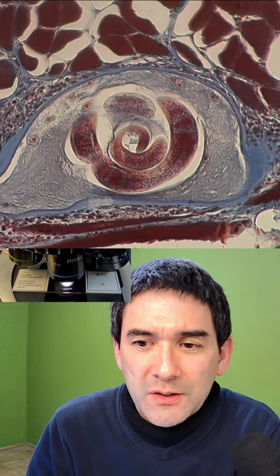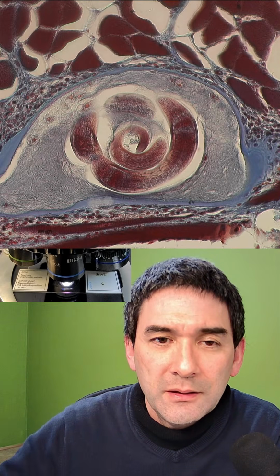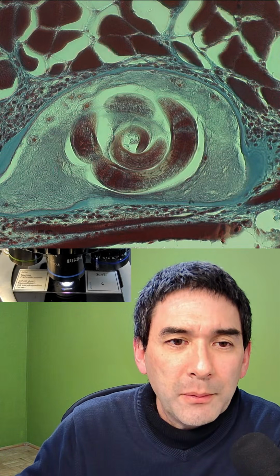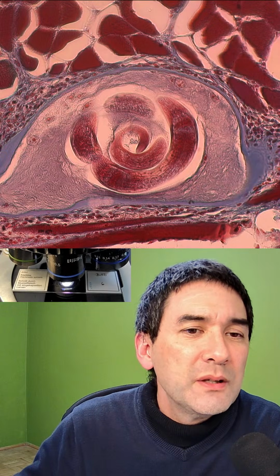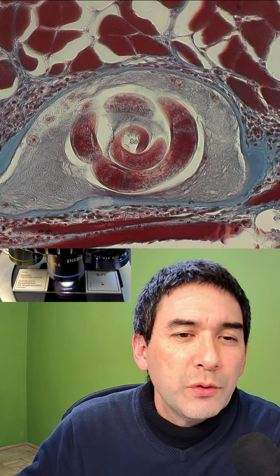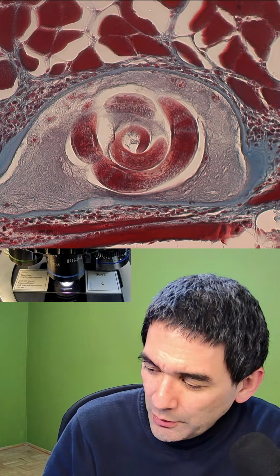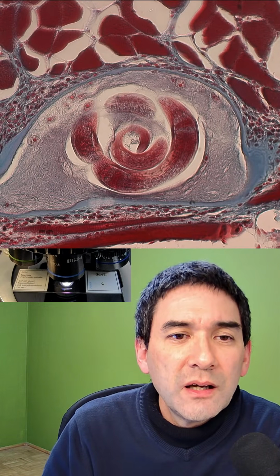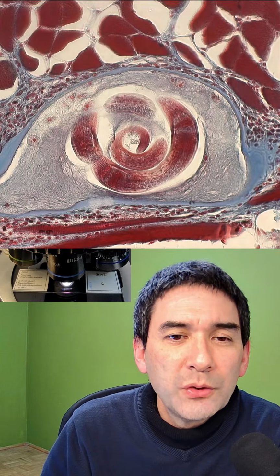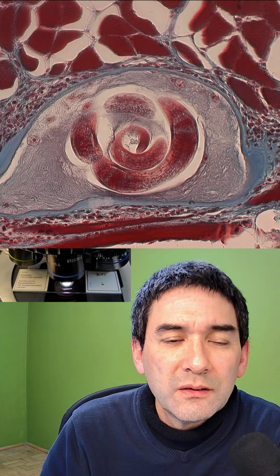So this is a little bit the thing here. When I change, for example, the upper prism, then you see how it's able to change the colors. But sometimes it will not invert the colors, because it depends a little bit, I think, on the refractive index and on the bottom polarization. I can also try to change that a little bit, but it will not go. Obviously, this is not a very good specimen for this.